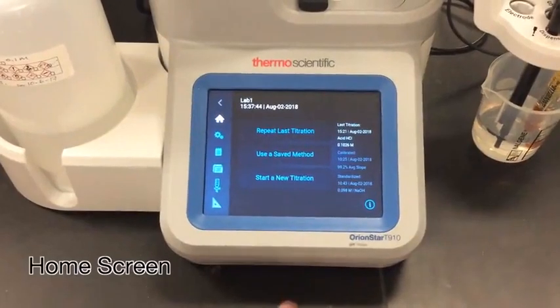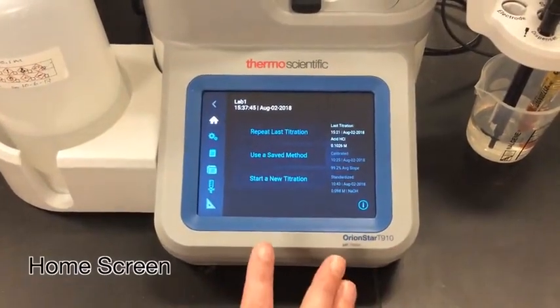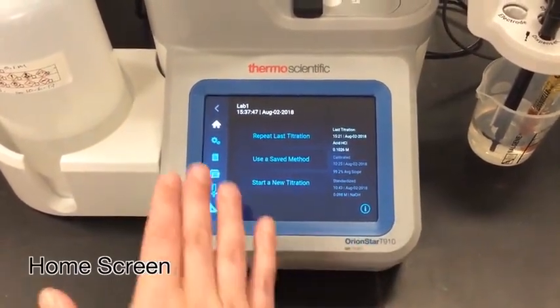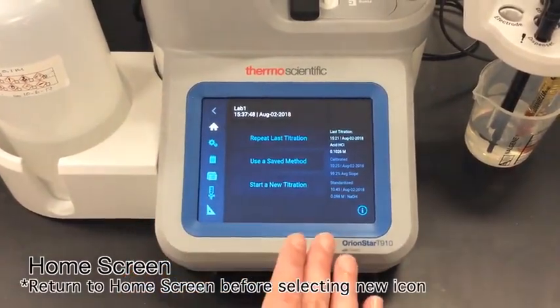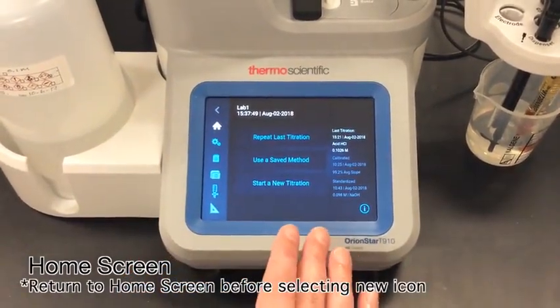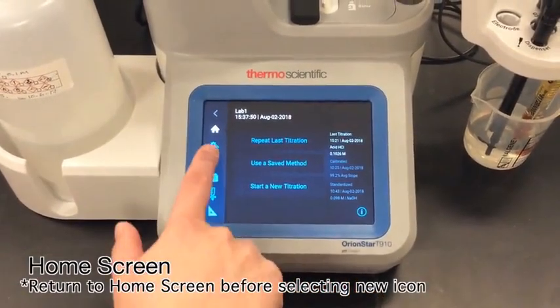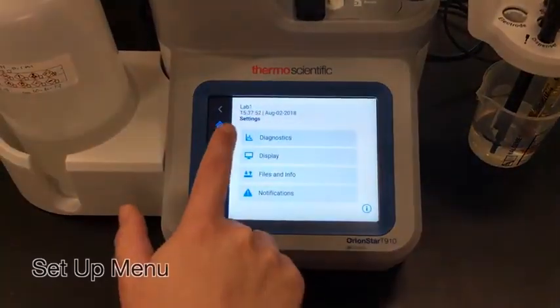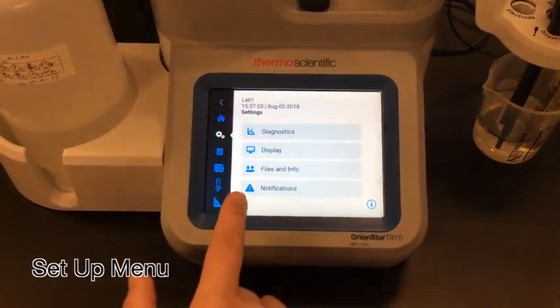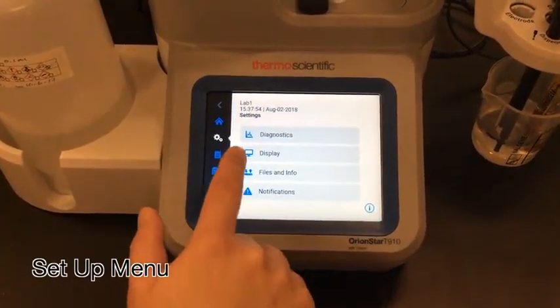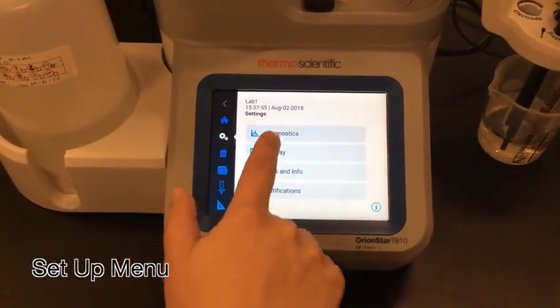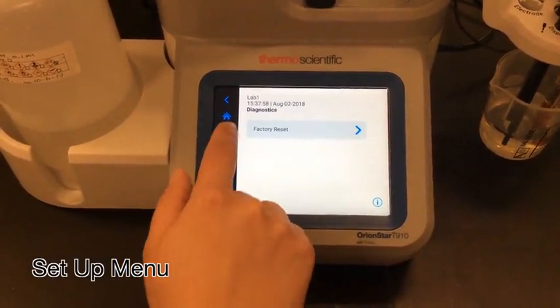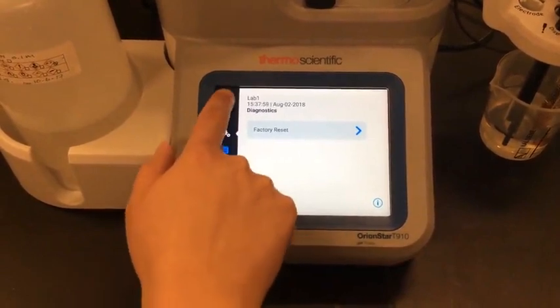I'm in my titrator home screen, and from here I have access to pretty much all the titrator functions I need. The first thing I'm going to do is go ahead and look at my setup menu. From here I can change all of my instrument settings, go into the diagnostics, and do a factory reset.